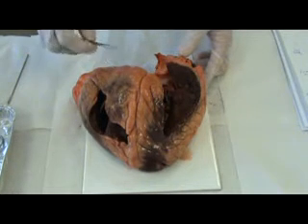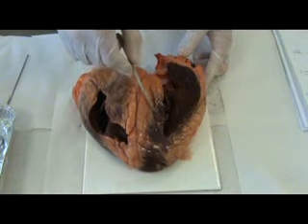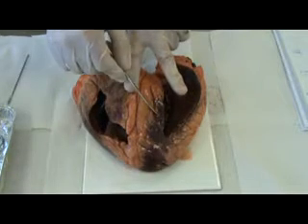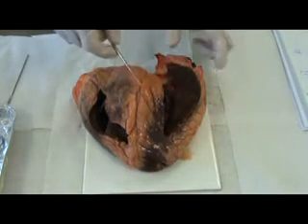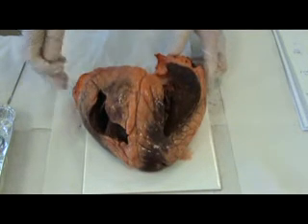The branches have, at different points, a bifurcation, so they branch into two. And this is allowing the delivery of blood into the tissue that needs it.